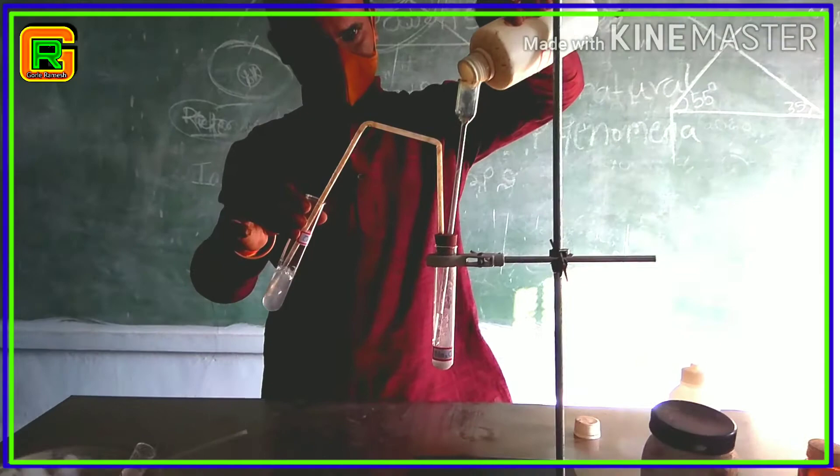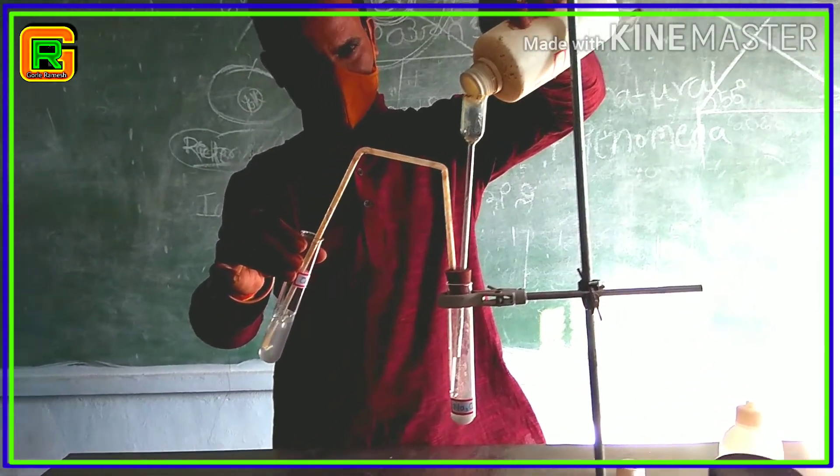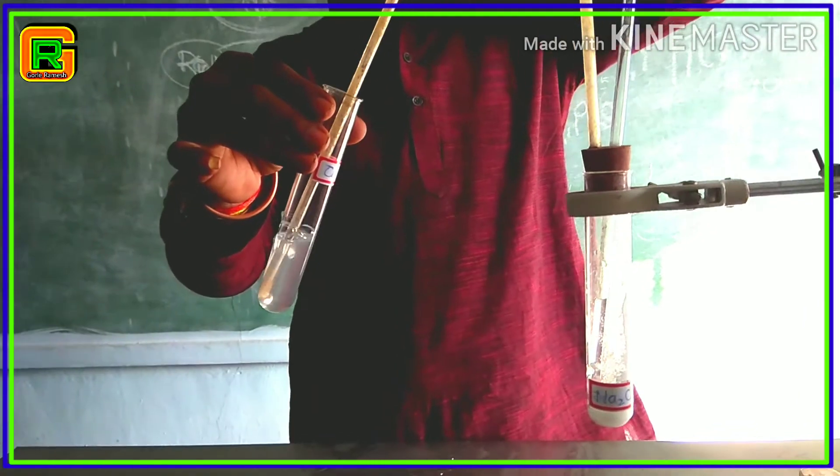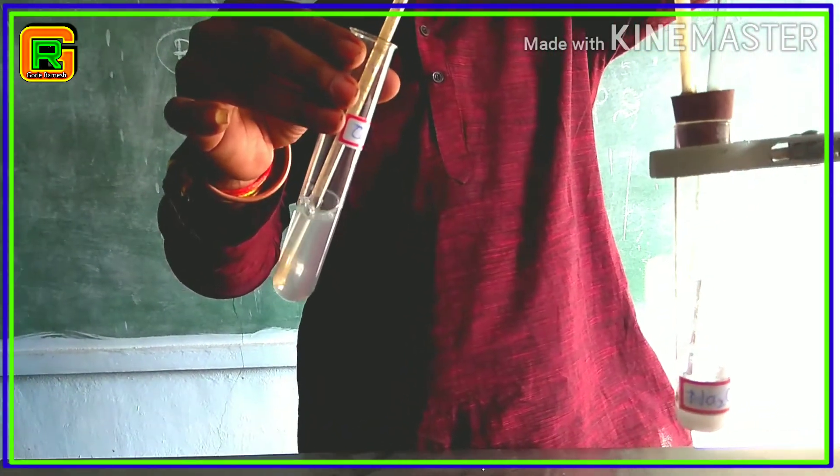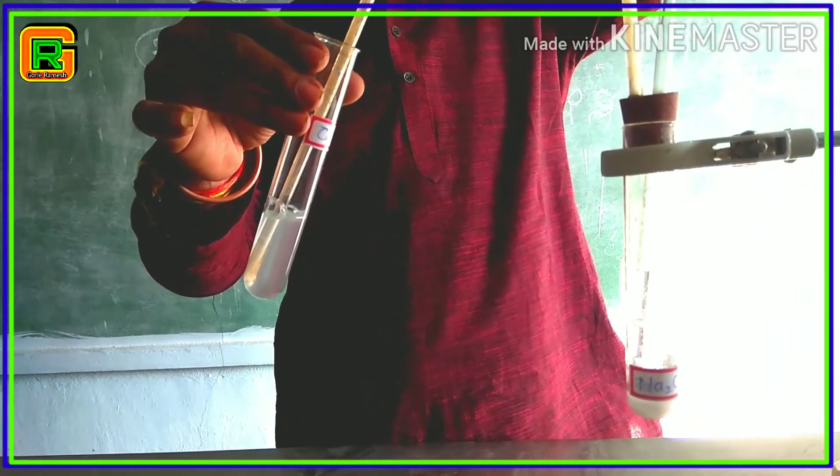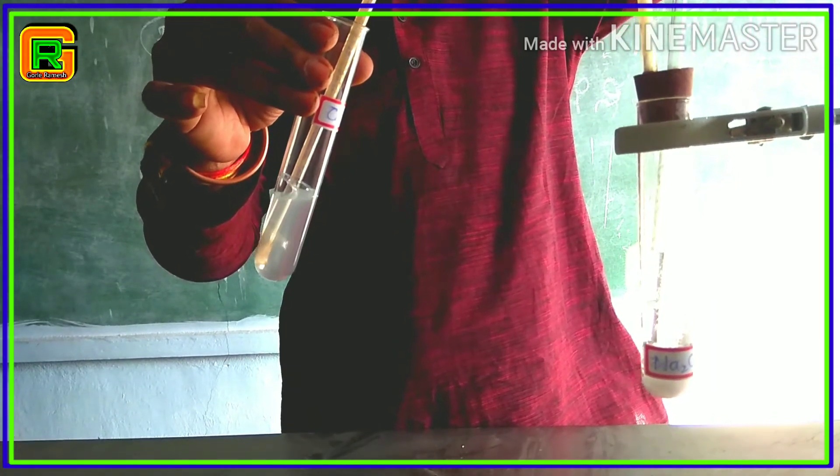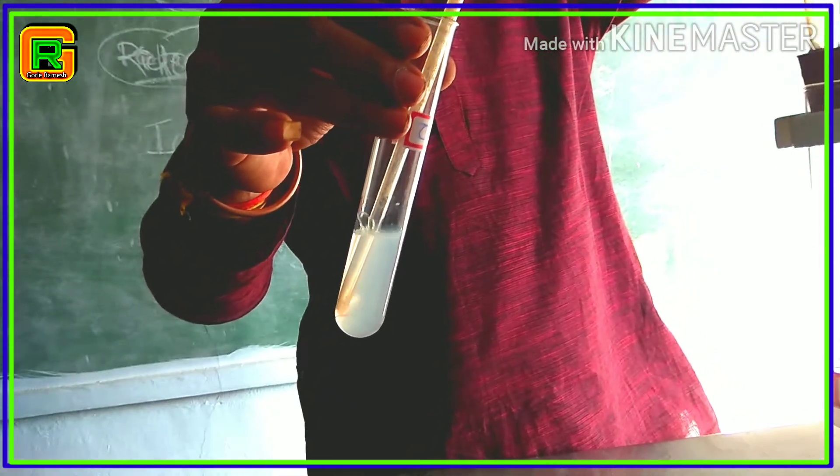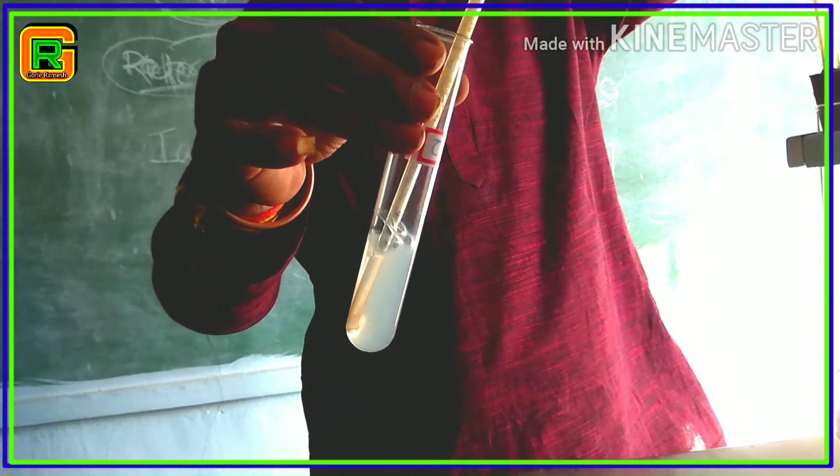What do you observe? One type of gas is evolved when dilute HCl is added with sodium carbonate. Now, pass the gas produced through lime water and observe carefully. Here, the colorless lime water gradually turns into white color. This white colored precipitate is calcium carbonate.